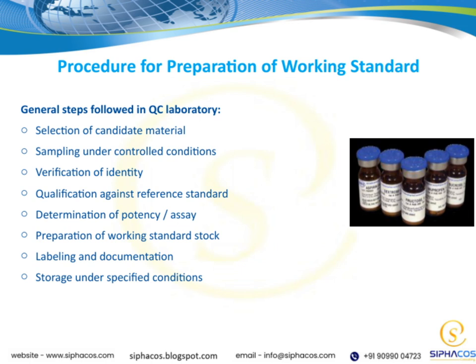Proper preparation ensures reproducibility and precision in subsequent analyses. Labeling and documentation are next. It's crucial to clearly label our stock with all relevant information and keep detailed records. This ensures traceability and consistency over time.